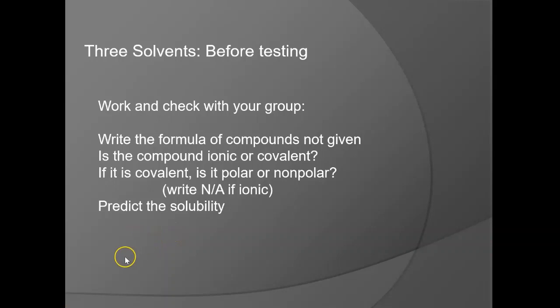And the last thing you want to do is predict the solubility of these different substances. And remember, it's a hypothesis. It's okay if it's wrong. If your prediction is wrong, then you learned something. So it's fine. Don't go back and change it and make yourself look like an amazing psychic-powered individual. Make a prediction and stick with it. That's not something I'm going to grade for whether they were right or wrong. It's a thing that you predict before you do the test.